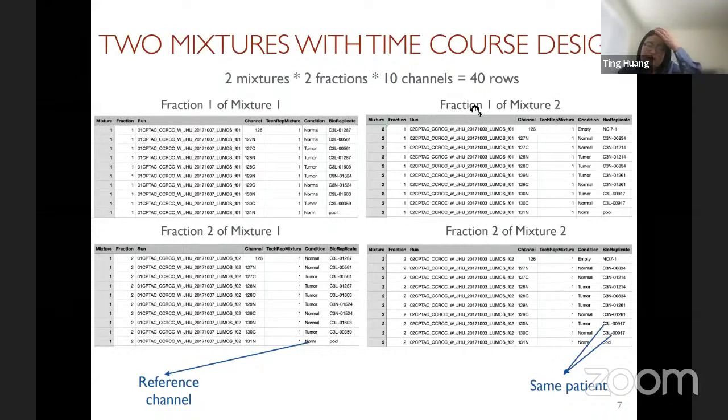Okay, I think that's how we prepare the annotation file for MSstatsTMT. I know that compared with MSstats we have more columns, but it's because we also have more complicated designs. In order to let the tool make a correct decision, we need to tell it the correct information here.